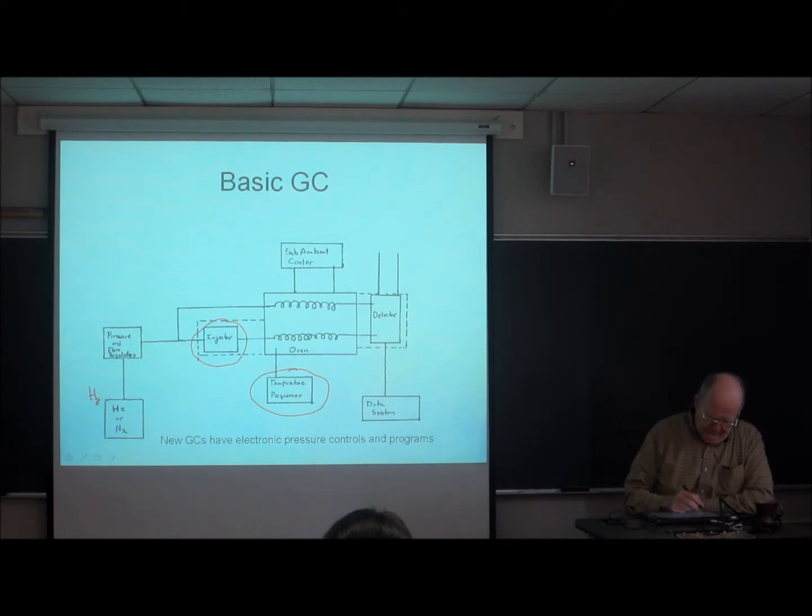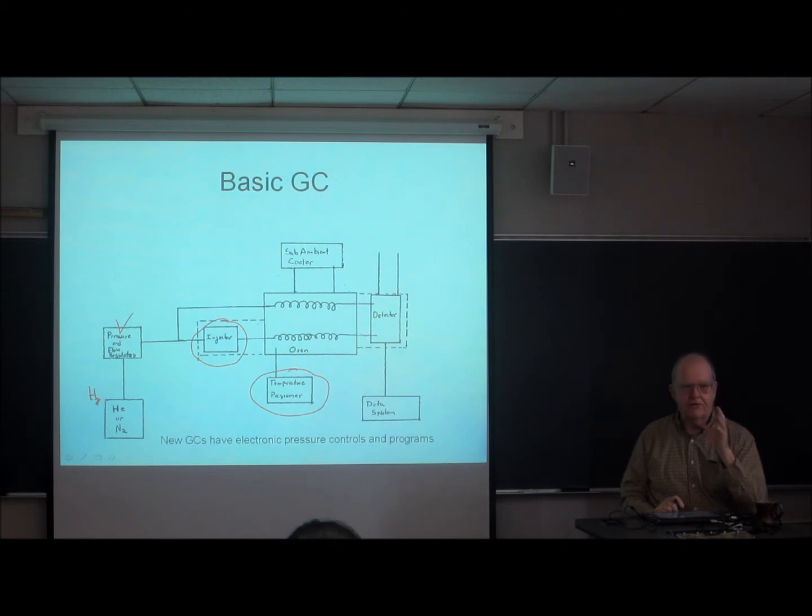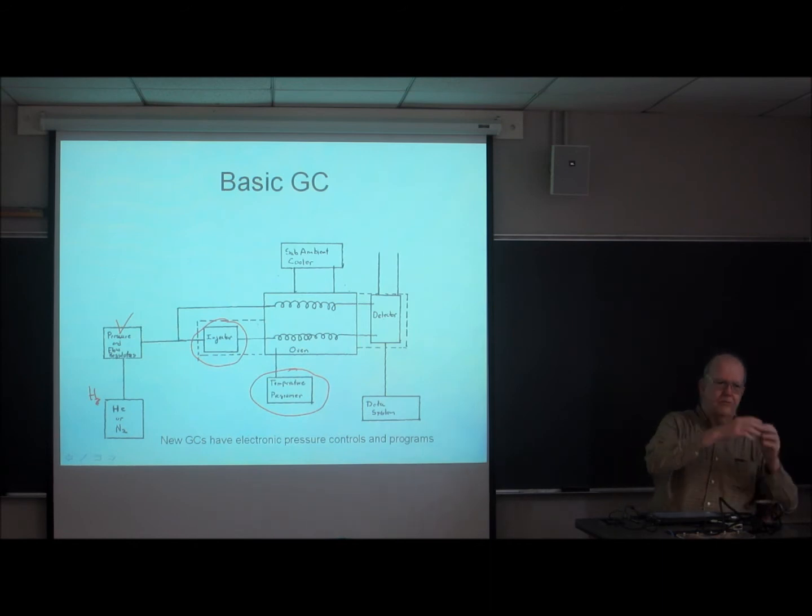So there's always, between the tank and the rest of the chromatograph, a system of delicate pressure regulators that can really hold it quite constant, and also flow controllers. But basically, in most gas chromatography, the flow rate is set essentially by the flow restriction offered by the column to the pressure set on the regulator.